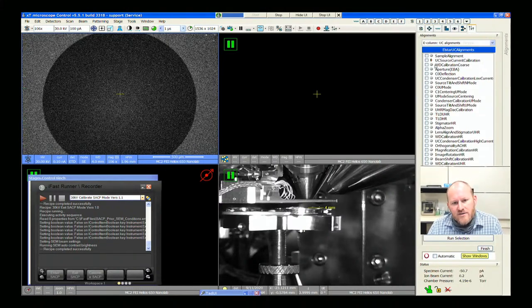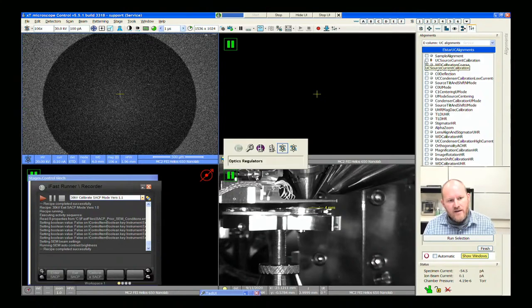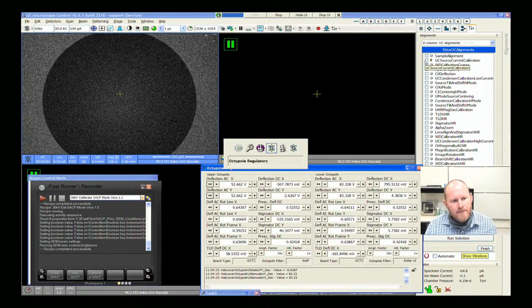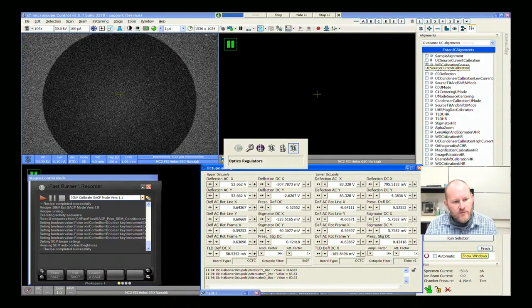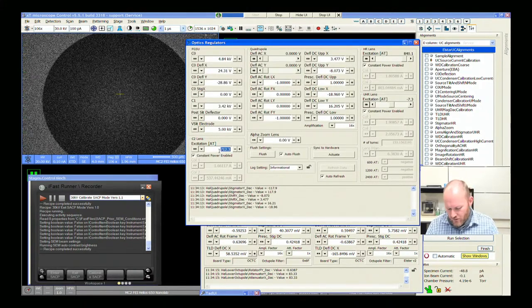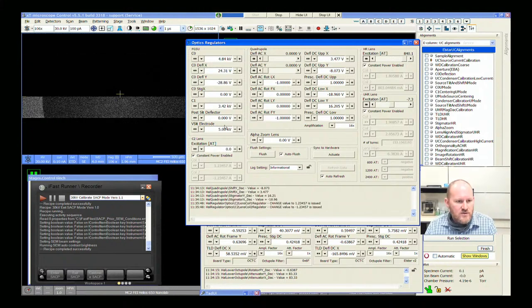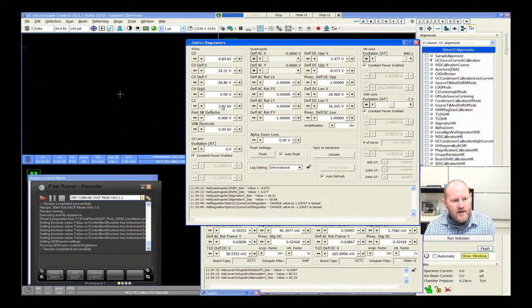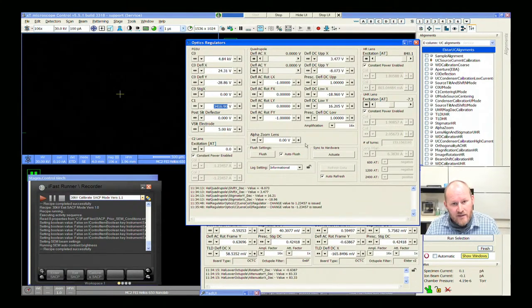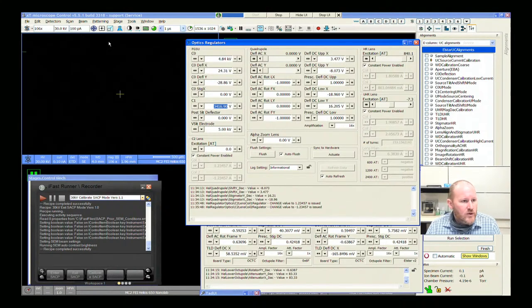What we found is the easiest way is I can come to the optics regulators and set C2 to zero, then focus C1. This is not very responsive though — FEI or Thermo did not design this as a real control, it's more a display. Let me go back to 100 picoamp and that should revert.